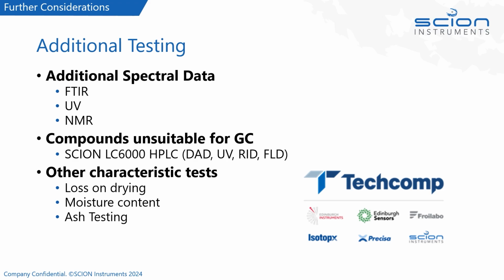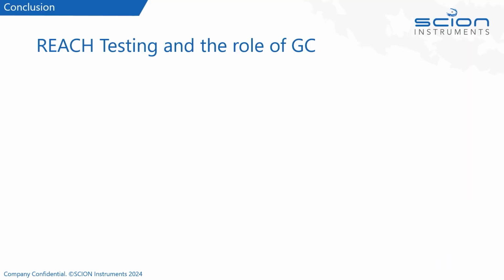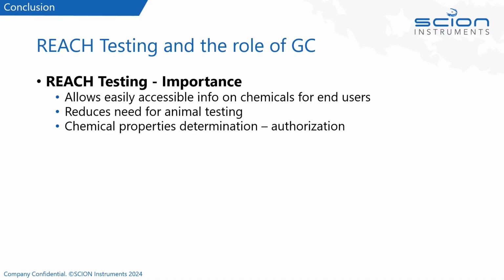So now I'd just like to quickly sum up this webinar. Hopefully I've given a good overview of what REACH testing is and also the role that gas chromatography can play in this testing. I've tried to emphasize the importance of REACH testing. One thing I'd just like to say here is that the REACH regulation allows easily accessible information on chemicals for end users. It's also led to a reduction in the need for animal testing.